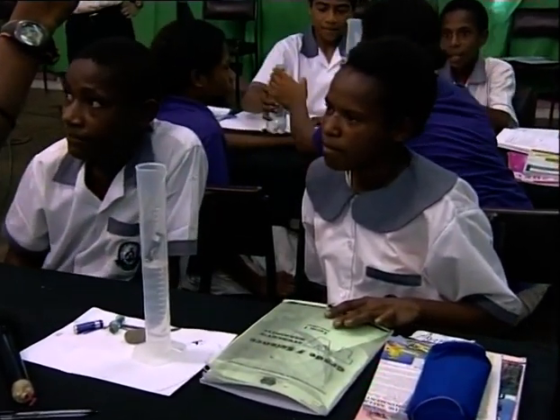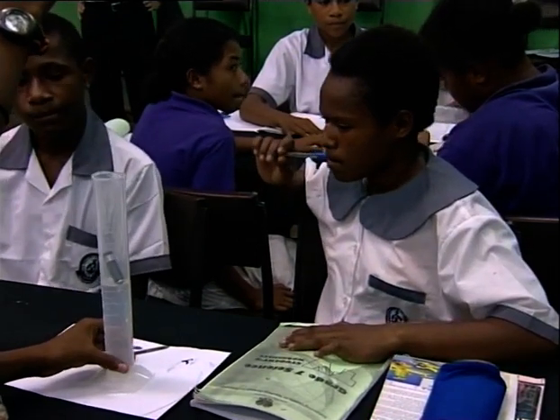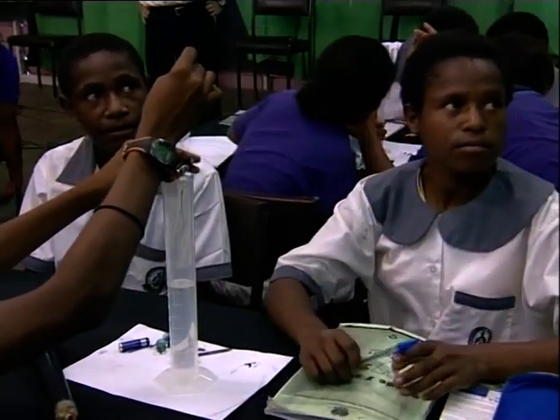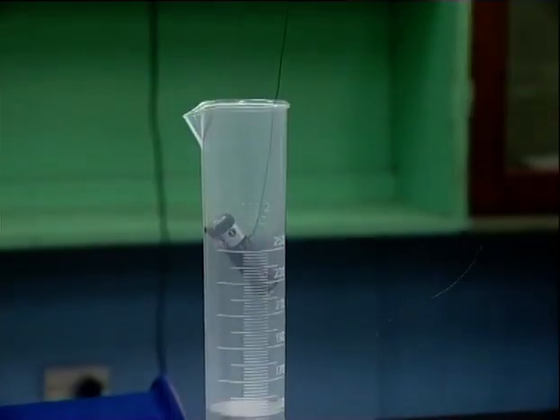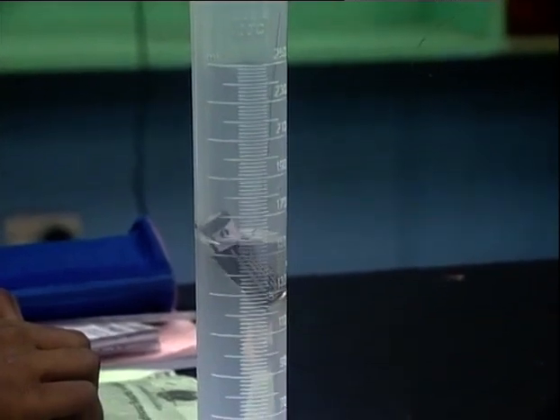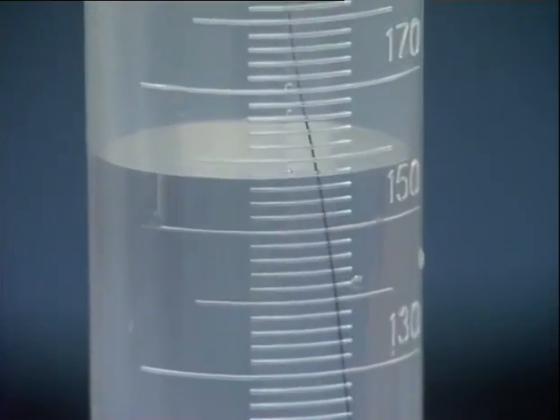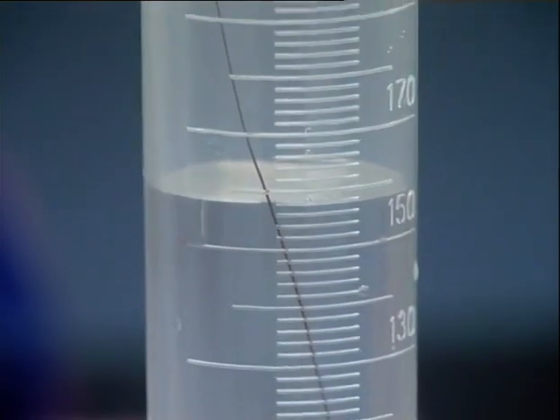You can either tie the solid with a piece of wire so it will be easy for you when you remove the solid. Okay, sink it down slowly to the bottom. All right, have a look.